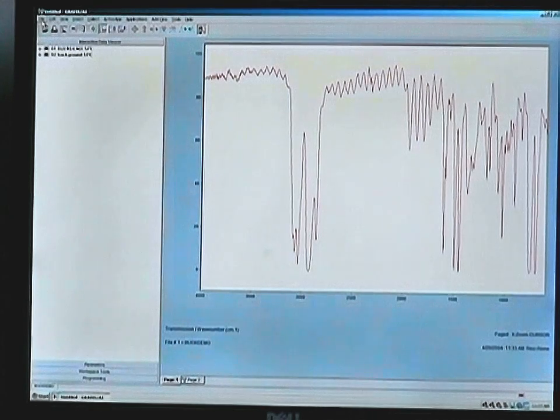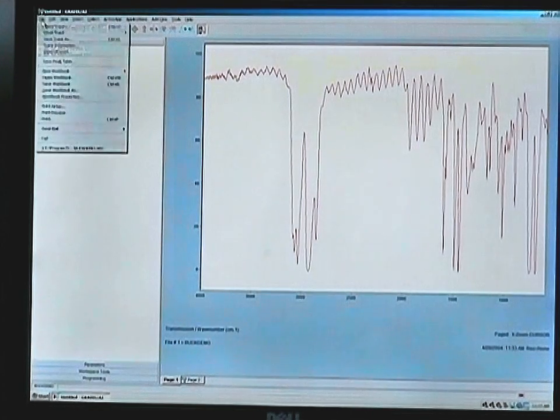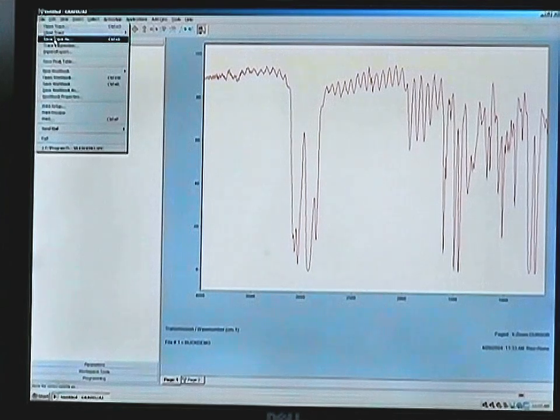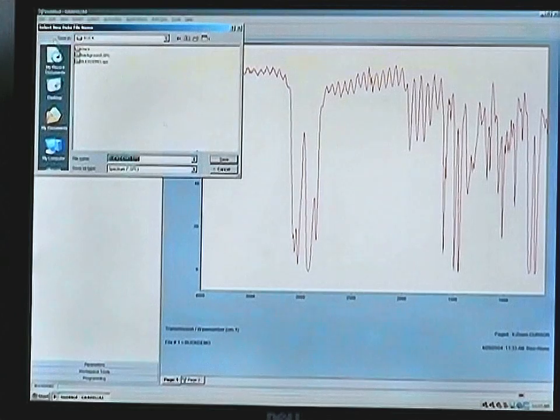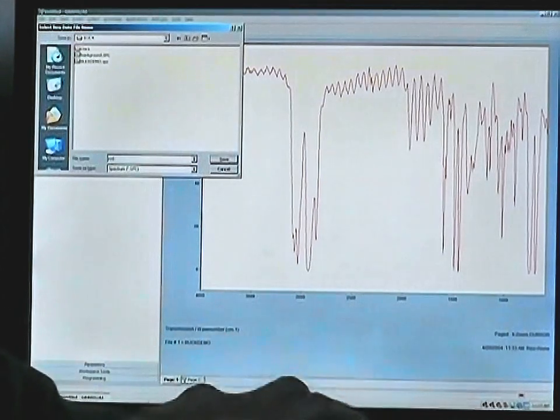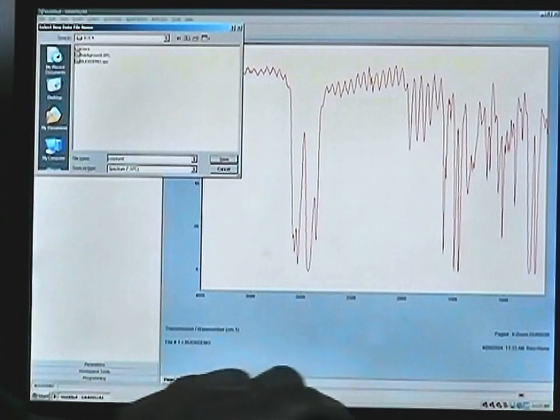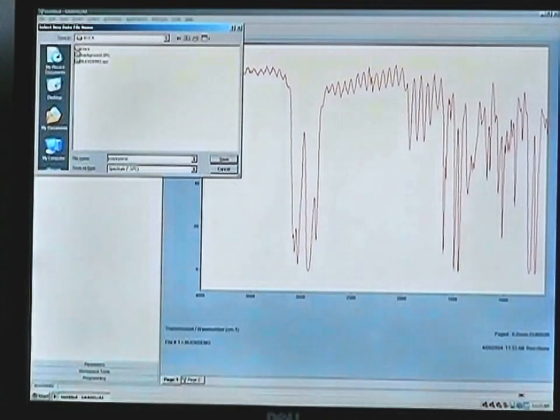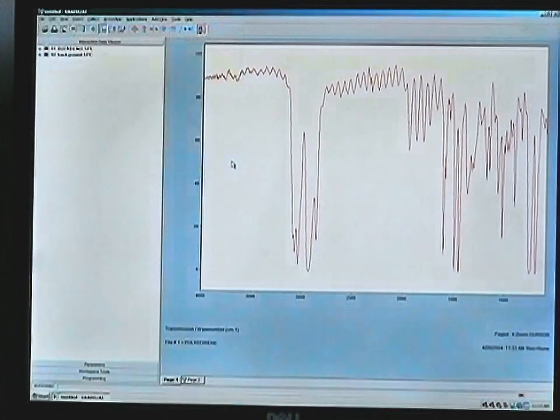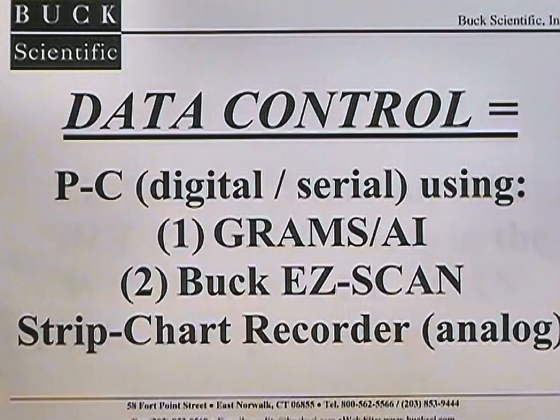As the process is completed, it will return you to the GRAMS AI screen and you could do whatever manipulations you want. After the process scan is completed, save the trace under a specific name, and this way you can retrieve it for future analytical work, library searches, or quantitative analyses. This concludes the basic operator training video.